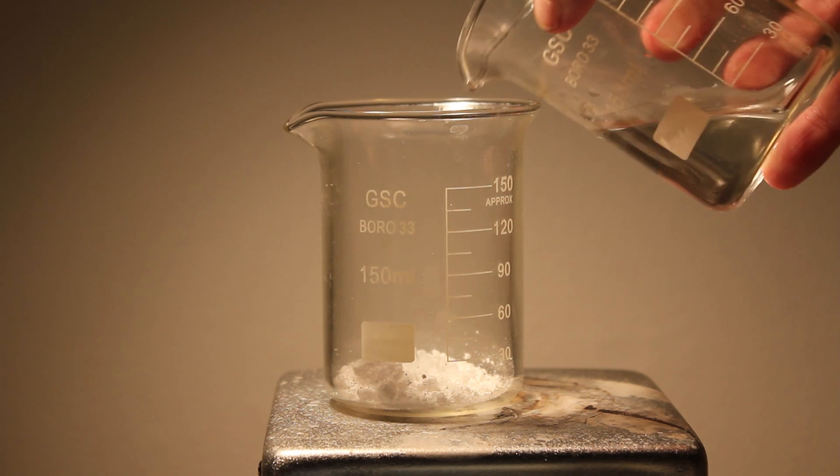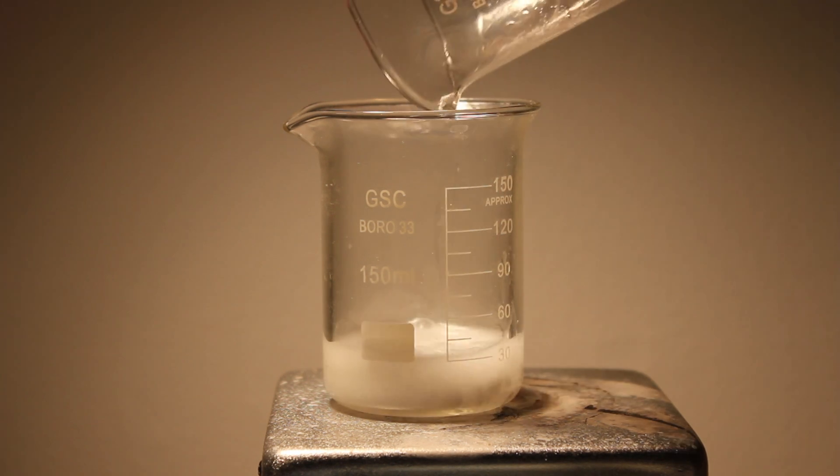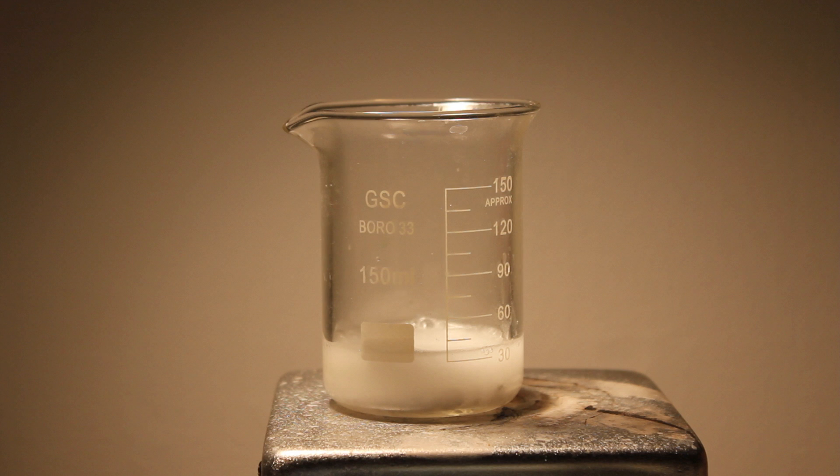First, 3.6 grams of acetylsalicylic acid are added to a beaker. Then, 20 milliliters of water are added.